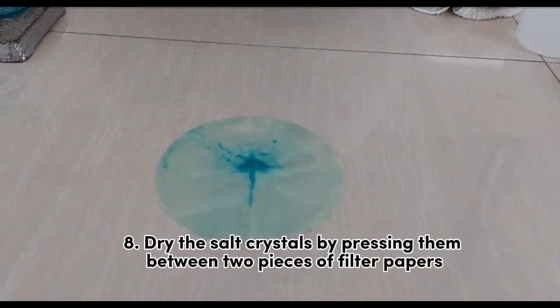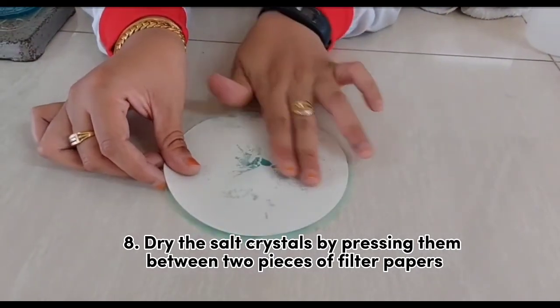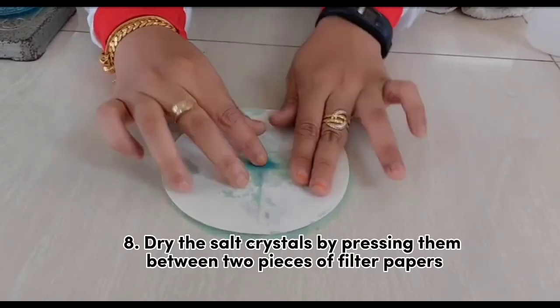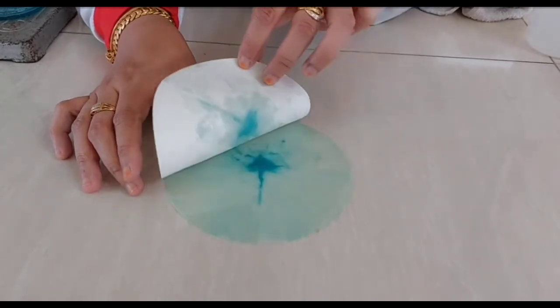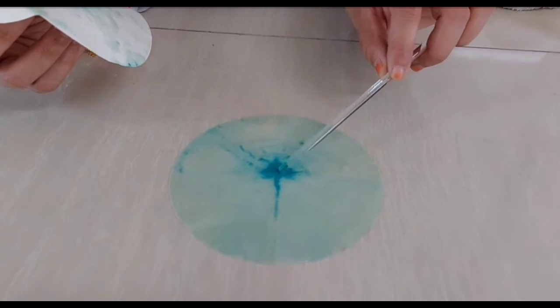Dry the salt crystals by pressing them between two pieces of filter paper. Now, you can see that the color of the salt crystals is blue, which means that the copper nitrate salt is formed.